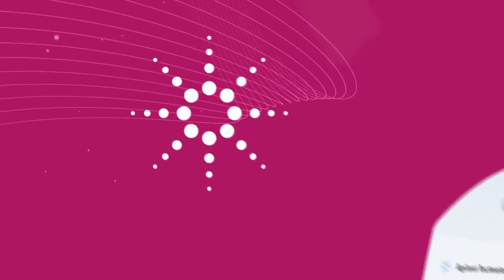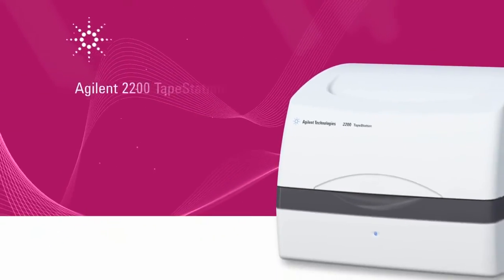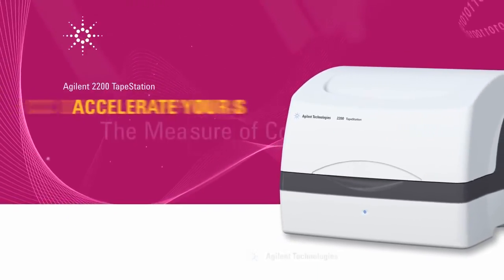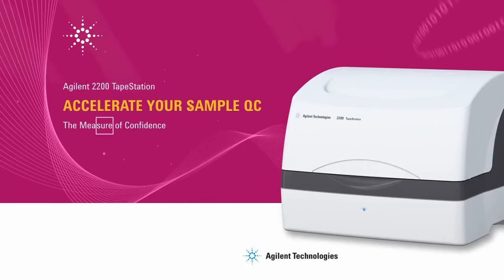The Agilent 2200 tape station. Accelerate your sample QC with confidence.